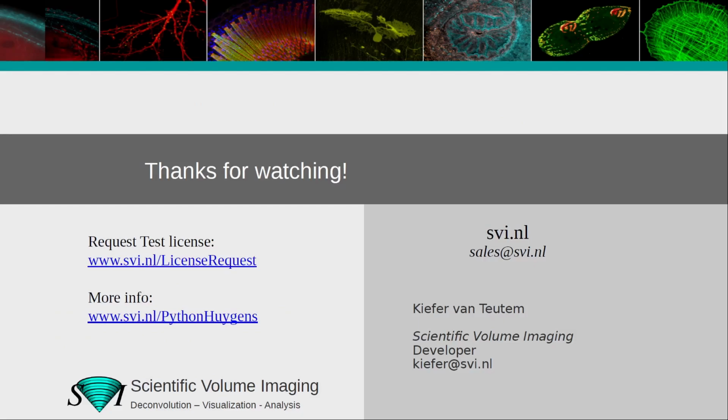Alright, I hope you've learned a bit about the Python shell and the Python interpreter and how to use it. There are a lot of different options, so I really recommend going to our website and going to Python Huygens if you want to delve into it a little bit deeper, or if you want to find out more about specific image operations, you can download the scripting manual and find all the options and all the image operations and table operations that you can perform.